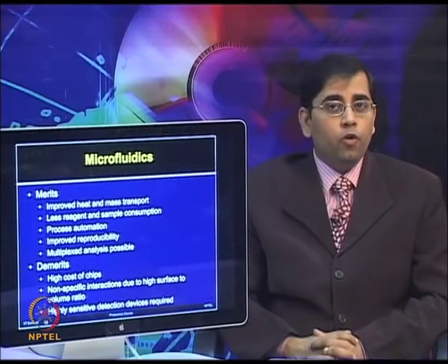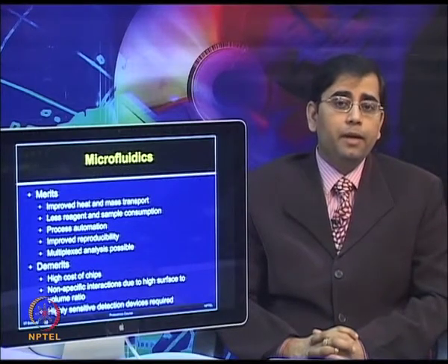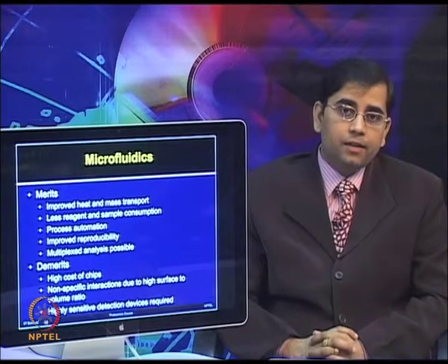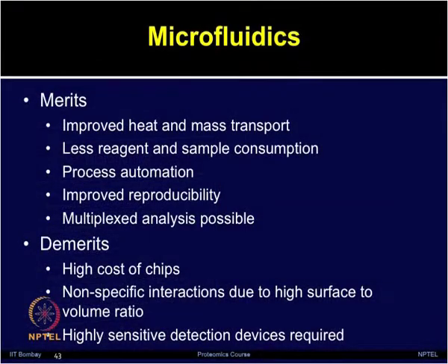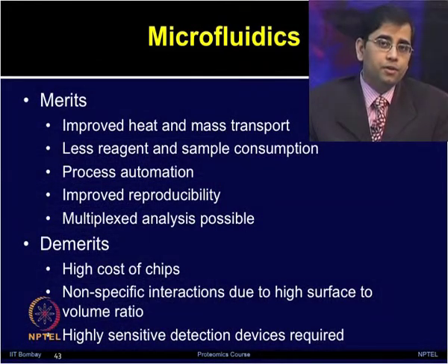So, microfluidic platform offers many merits, such as improved heat and mass transport, less reagent and sample consumption. The process is very automated. It also offers higher reproducibility as well as provides capability for multiplexing analysis.